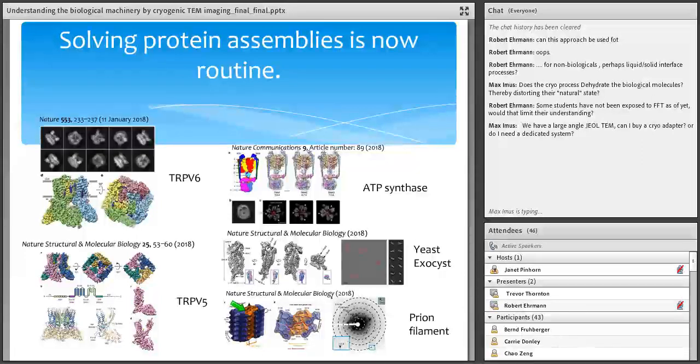Dwight, can you explain why they succeeded in going to 0.7 angstrom? It seems amazing. It's an amazing achievement, really. Because they're looking at electron diffraction, they're able to get to a little bit higher resolution. This was on an aberration-corrected microscope. Yes. Okay. Now I know why Katia was mentioning it.